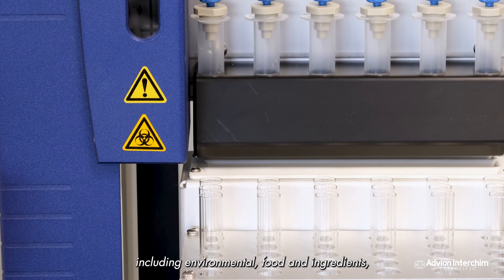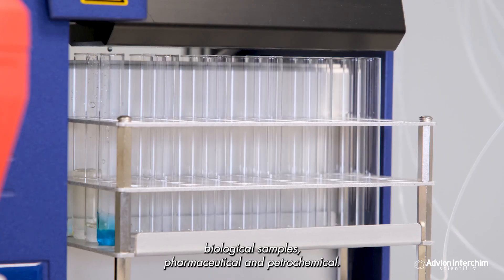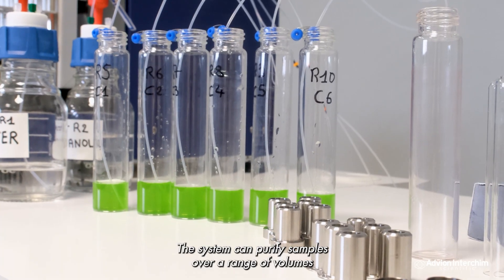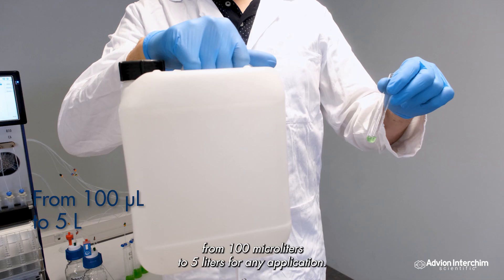Ideal for a wide range of applications including environmental, food and ingredients, biological samples, pharmaceutical, and petrochemical. The system can purify samples over a range of volumes from 100 microlitres to 5 litres for any application.